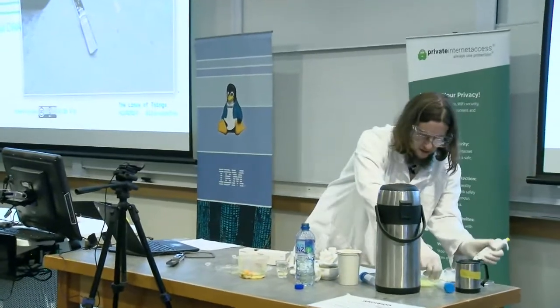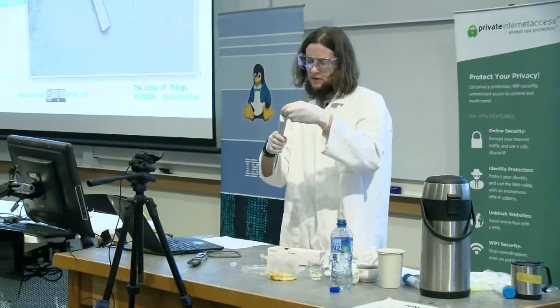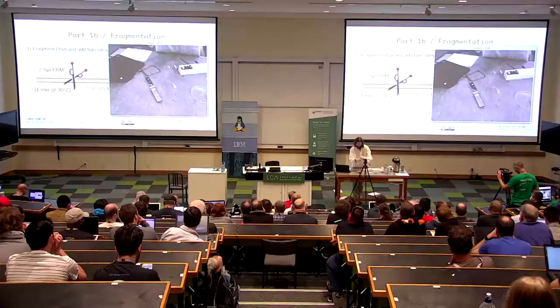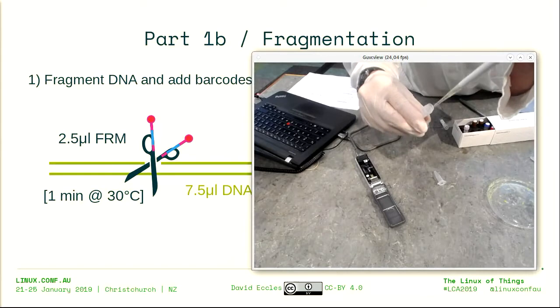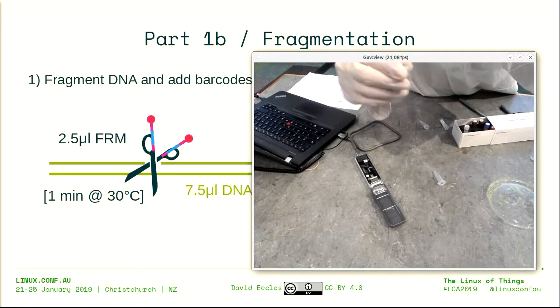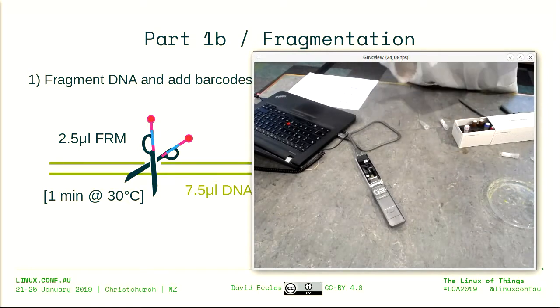Okay, so then we have the second barcoding mix. Oh. Okay, I managed to pick up something, and that's going to go in the 2 tube.